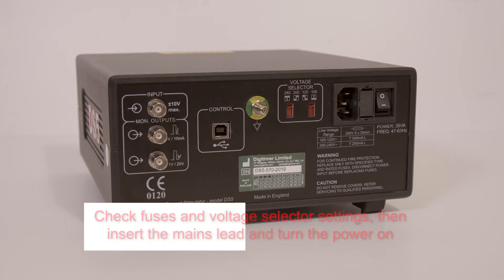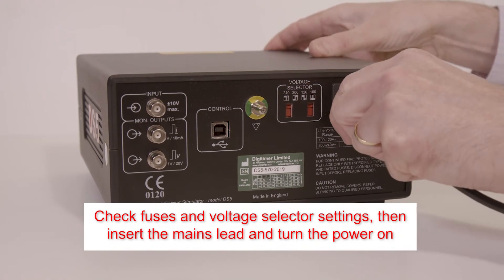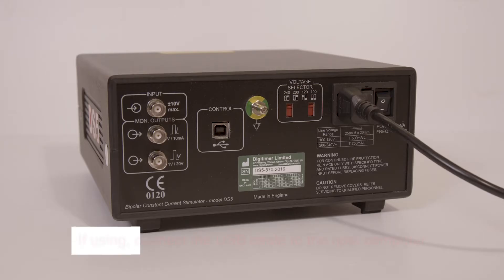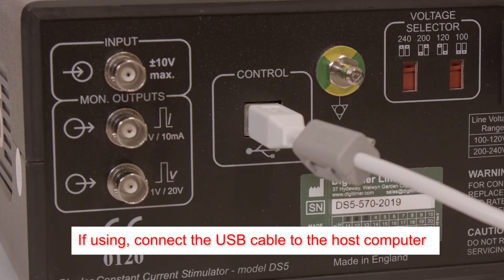Check the mains fuses are appropriately rated and the voltage selector is correctly set for your local mains supply. Insert the mains lead and turn the power on. For USB connection to a host computer, just connect the supplied USB cable between the DS5 and a free USB port on the PC.